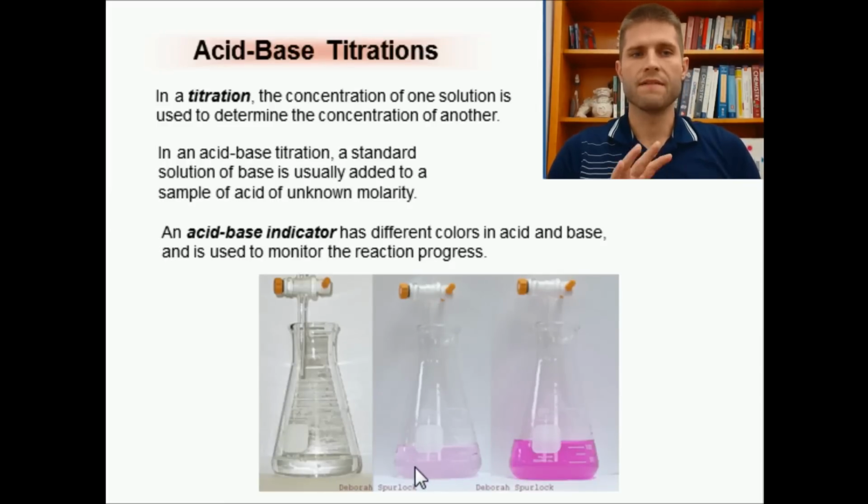Now, it's going to be a very light shade of pink once we eat away all of the acid, all of the moles of the acid solute. So what's happening is here we have moles of this acid. We have HCl moles floating around.